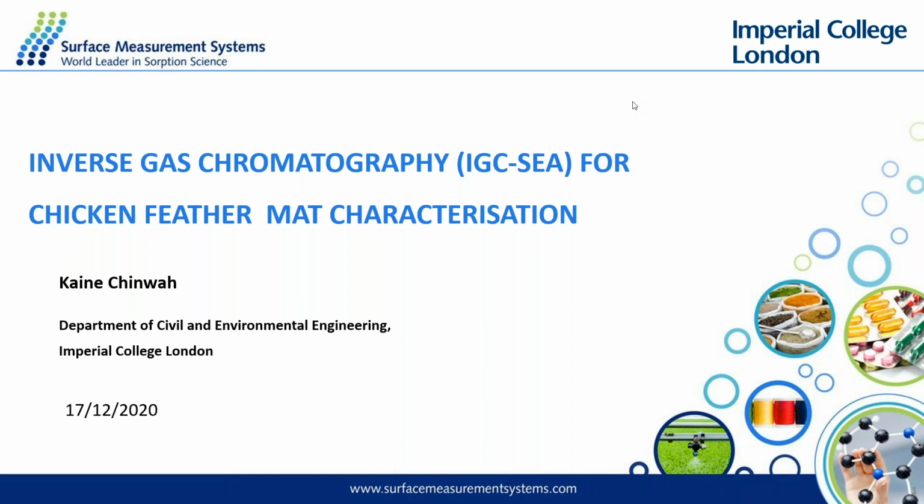I'd like to introduce my research work on chicken feather and specifically discuss the use of the inverse gas chromatography method to determine the surface properties of chicken feather mats.